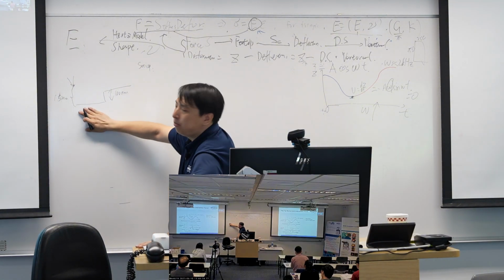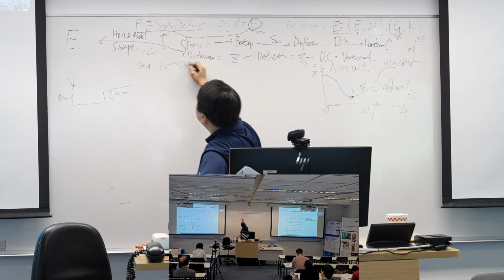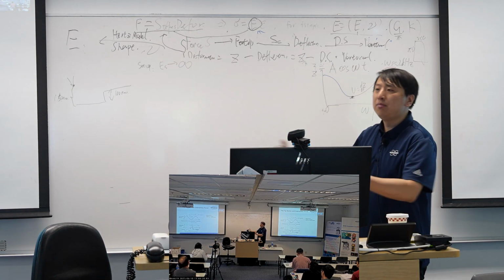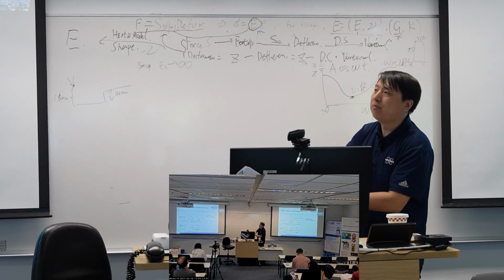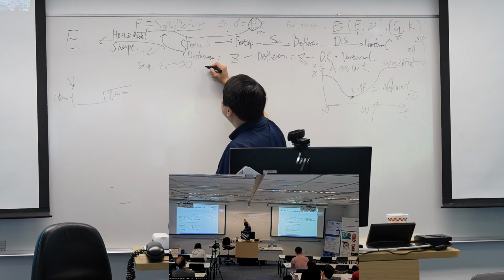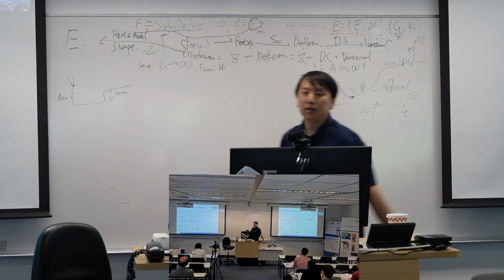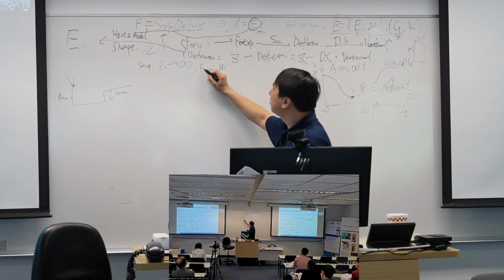I assume the modulus of my sample is infinite, so it cannot compress my sample. So I would assume once my force reaches 1 nanonewton, that's my maximum force.